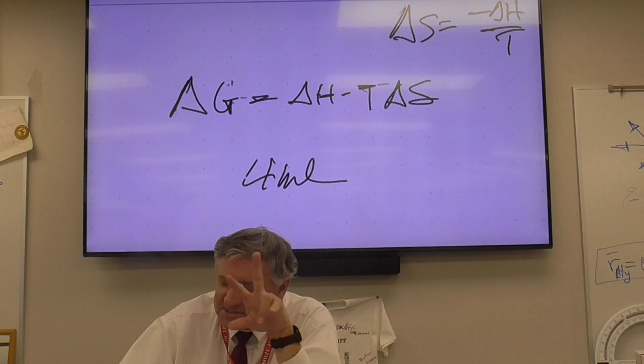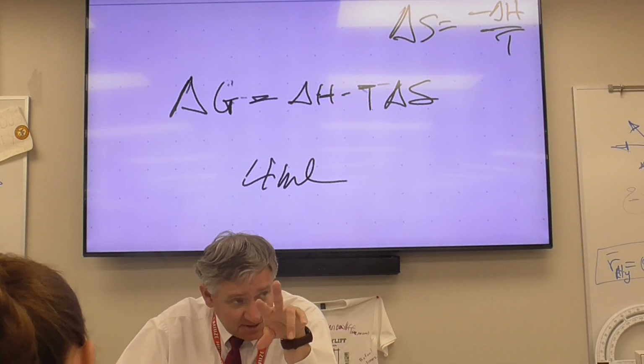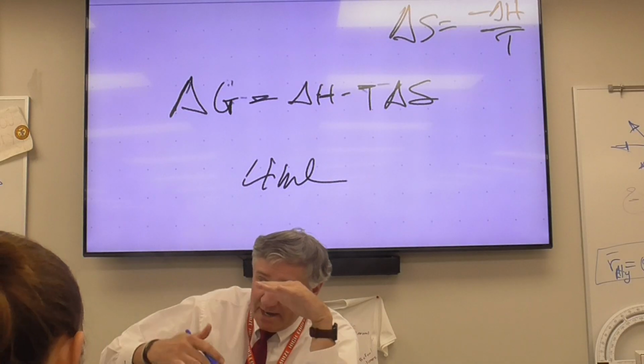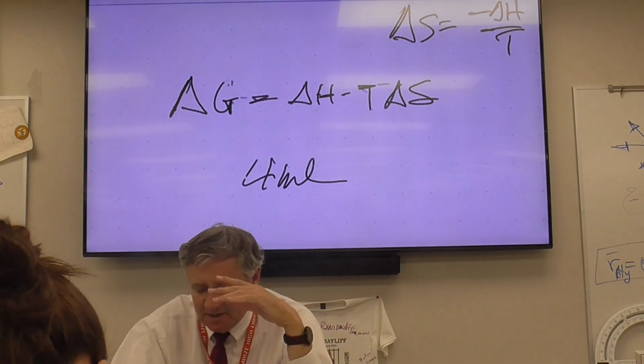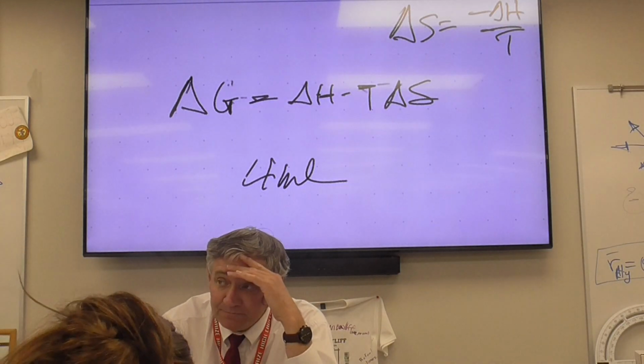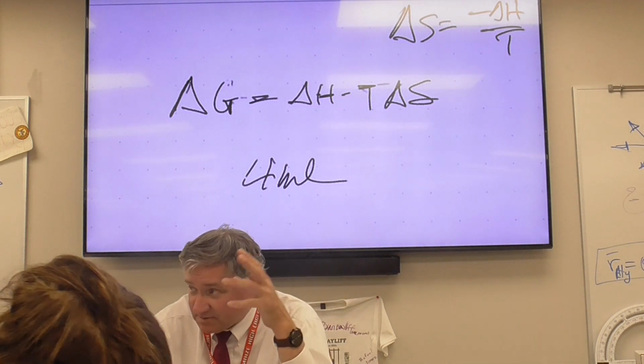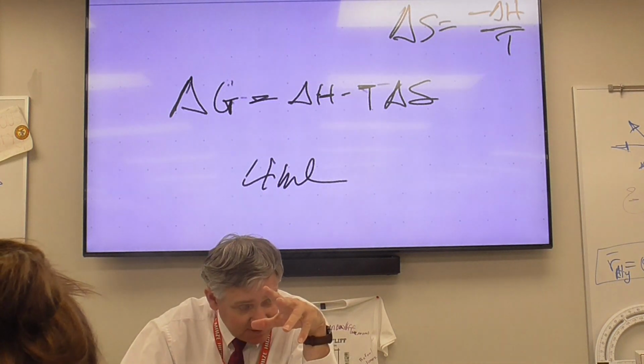Okay, that temperature change isn't going to be very dramatic, so pay attention to that. You want to record either the highest or lowest temperature that you're going to see. This one is going to be based primarily upon observations: is there a gas produced? Is there not a gas produced? What's going to happen to the change in temperature?